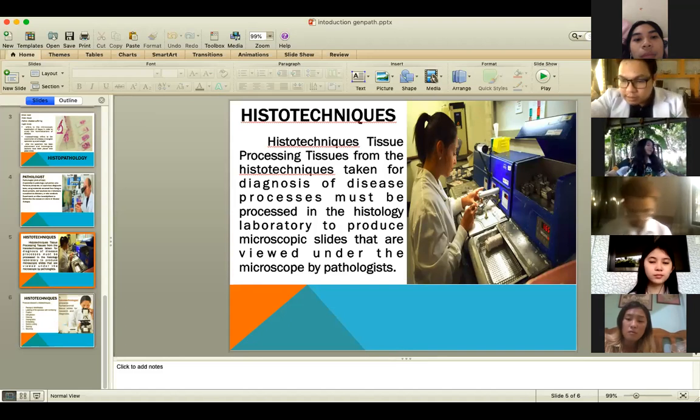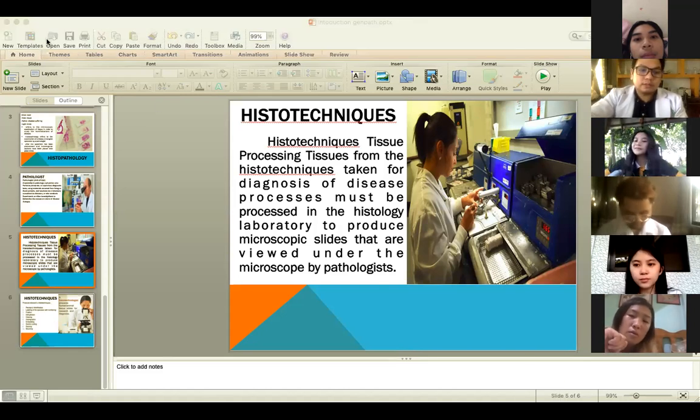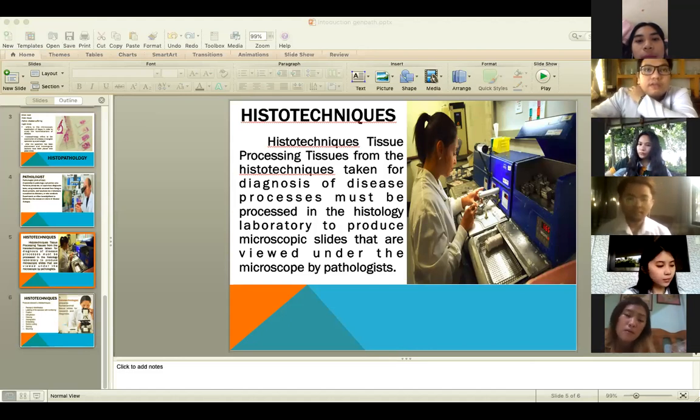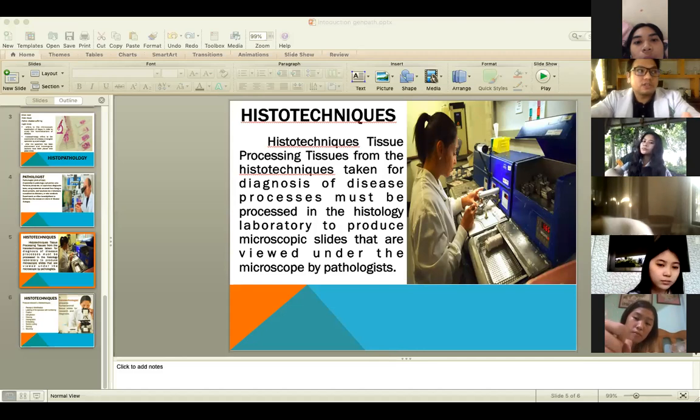Next topic is histoprep. Okay. Histologic preparation. Have you discussed this in histology? No? Yes, sir. We have discussed histologic. So we're going to run through with the different histoprep. Okay? What is histoprep? Okay, the different types, the methods, advantages and disadvantages of the examination of fresh tissues.